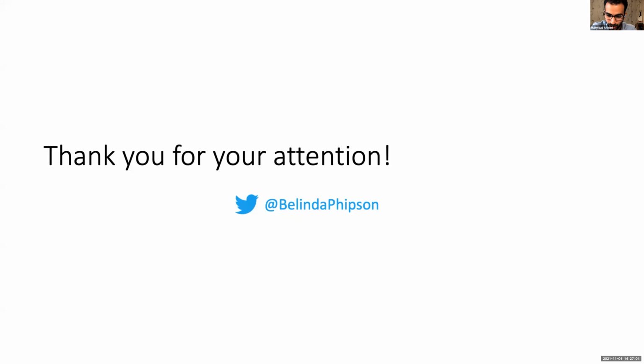We have another question here from Stefano. The question reads: I was curious about the two bias plots showing the number of CpGs with statistical significance. Why do we see a step and not more of a linear relationship?